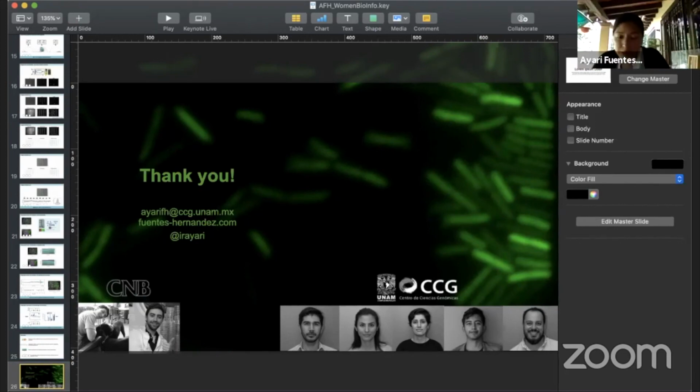Yes, for this tracking, we tried a lot of things, and nothing worked very well. So it was really time consuming. Then they published this, I don't know, 5 or maybe 8 years ago, and it just worked really, really well. You have to take a video of the same thing that you want to analyze, and you can train it with that.